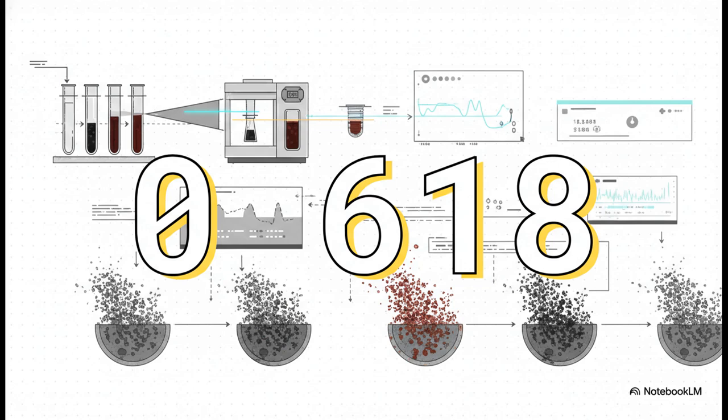This is what certainty looks like. It's not sort of darkish red. It's not black, but not very crystalline. It's a number, an optical density value spat out by a machine. This value, 0.618, is a direct measurement of the biofilm biomass. There's no room for argument. There's no interpretation. It's just data.